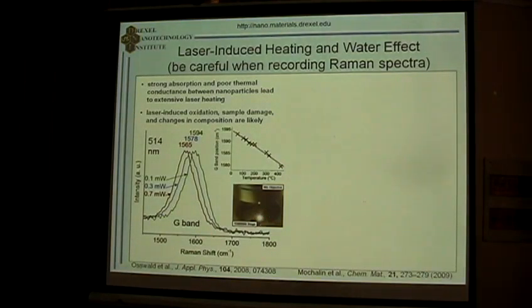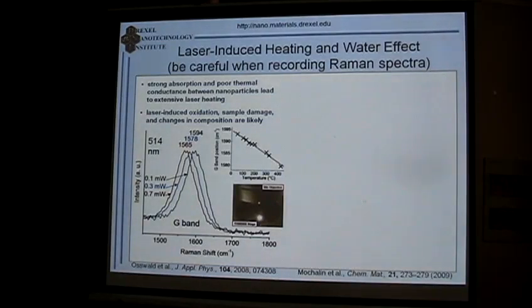The white light you see here is not because a white laser is used. As Mohan told us in the morning, whatever laser or color you have, if the temperature is high, it will look white. In this case, you have probably about 2000 degrees C. We were able to go well above 3000 degrees C and evaporate carbon with a very low power diode laser very easily, within tenths of a second of the laser pulse being applied. And this is very important to understand.